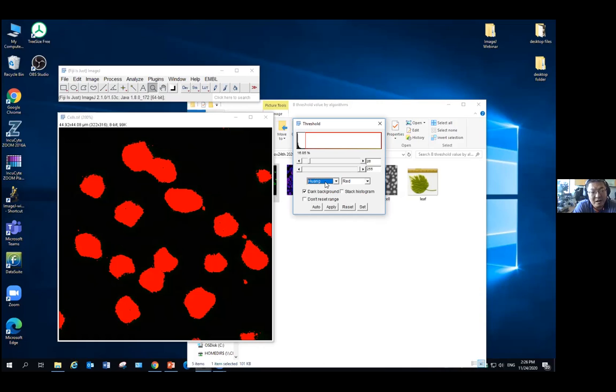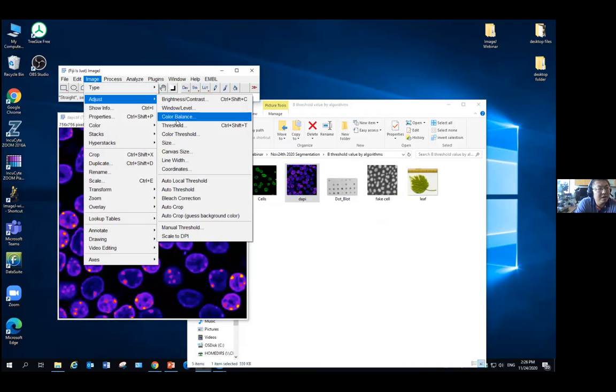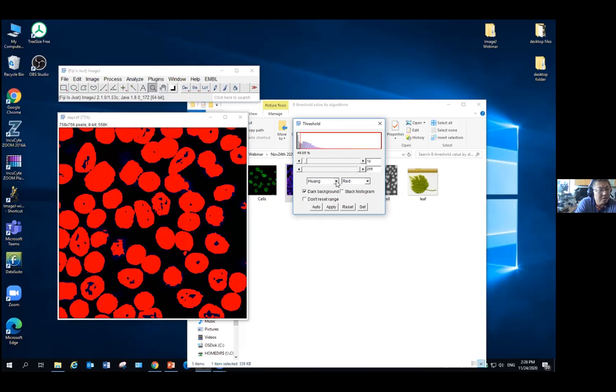We're still doing our analysis in a consistent way. So if two groups of images show a statistically significant difference in the measurement, we will still consider this a reliable result. Just not as good as if you can apply a single value to it. And you can play around with those three methods. You will say, for this one, okay, this Huang seems also good.